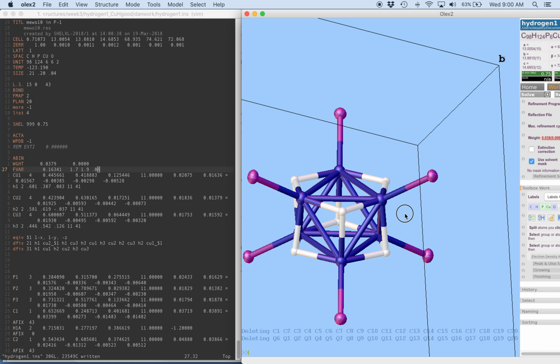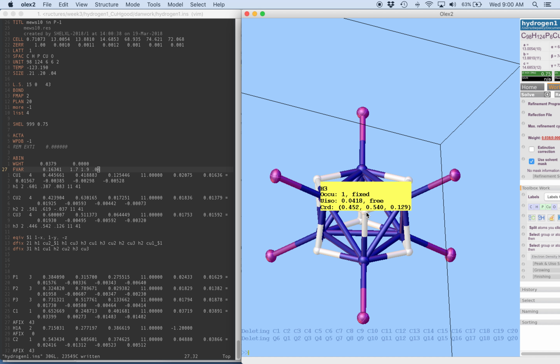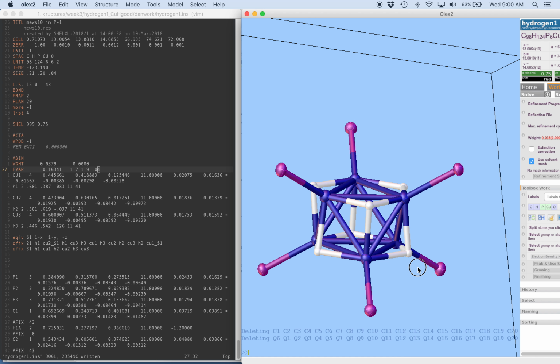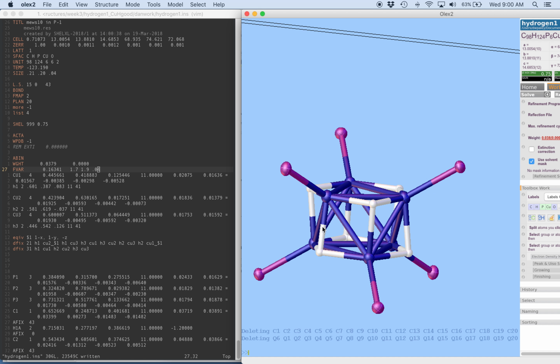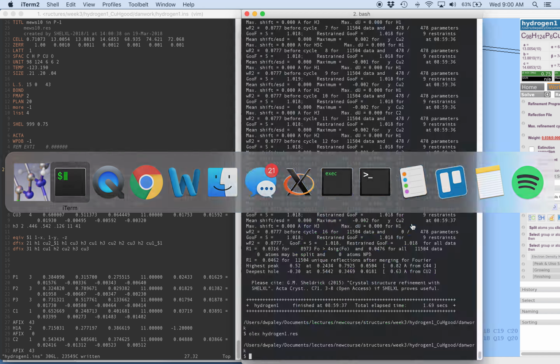Now we'll zoom in. Let's see, what did the ADPs refine to? This is 0.041. Obviously, the others are 0.041 as well. That's a good, reasonable number. How about the copper hydrogen distances? We have 1.73, 71, 72, 72, 72, 70. Okay, these are definitely more consistent now that we restrained them. We have 1.86, 89. Okay.